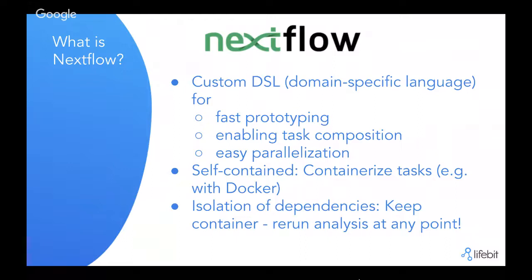And there's also task composition. This is similar to the processes, so each of them can run in a different language, which is really beneficial, especially if you're trying to update pre-existing pipelines. It can be really useful for that.